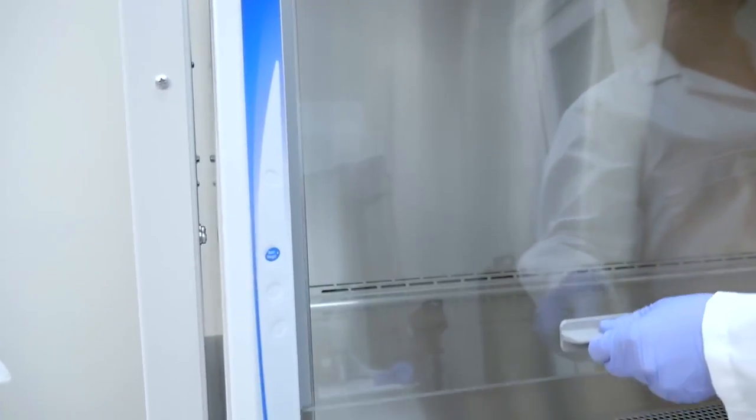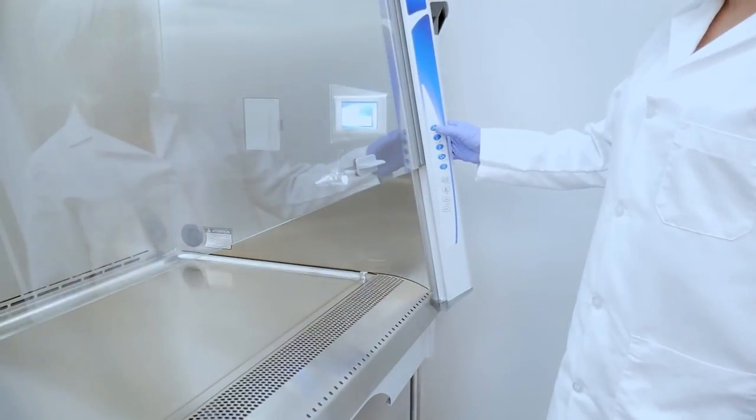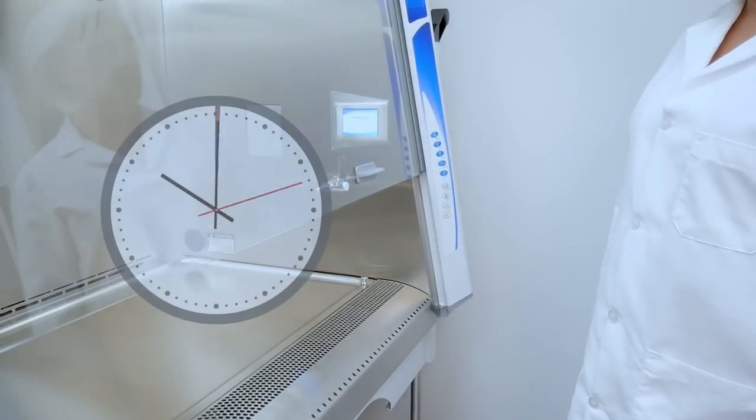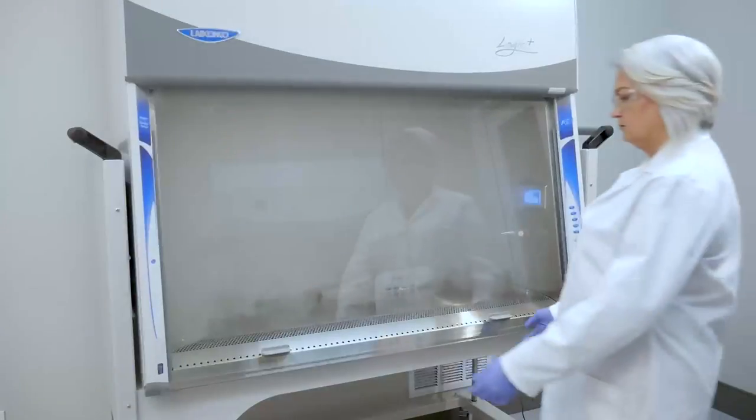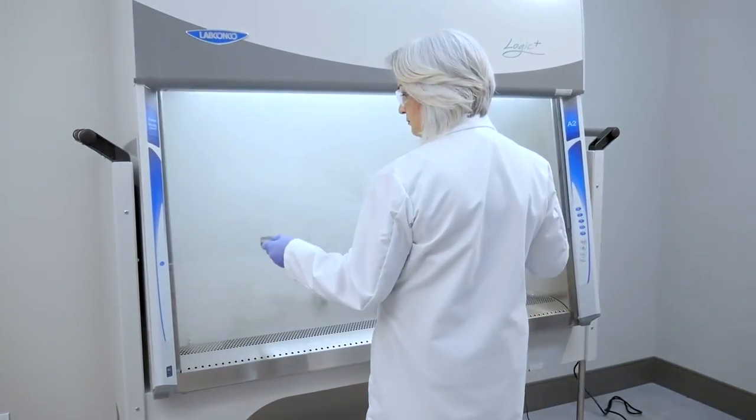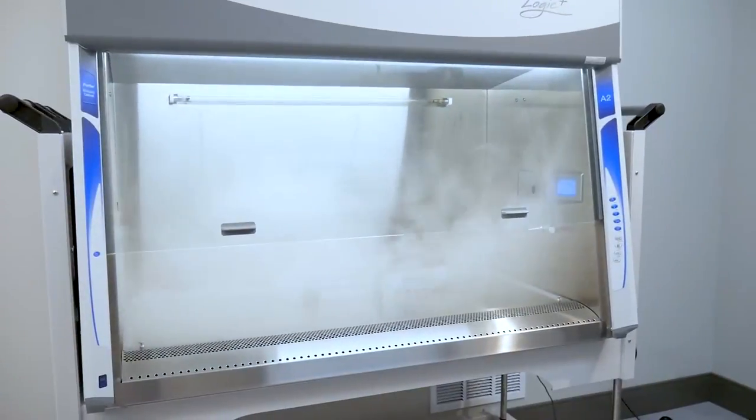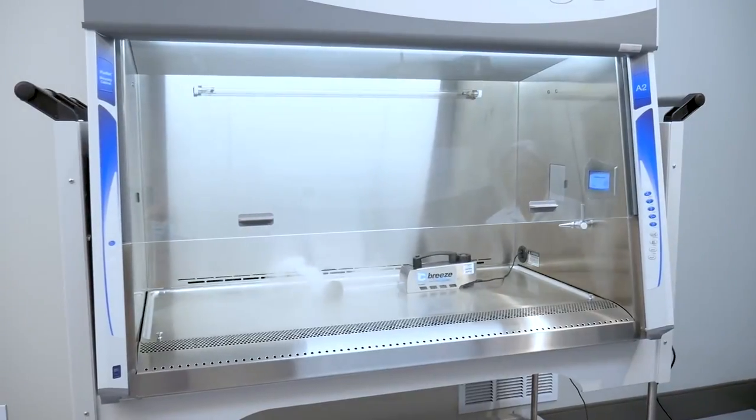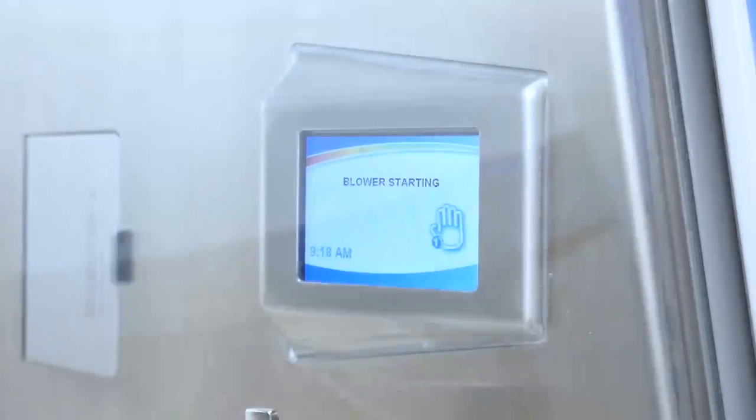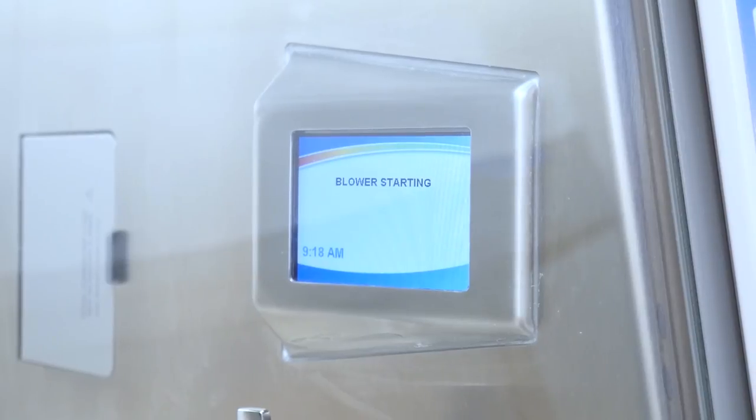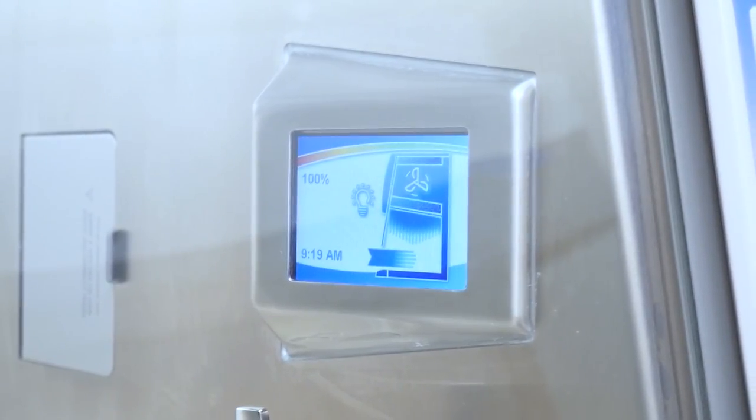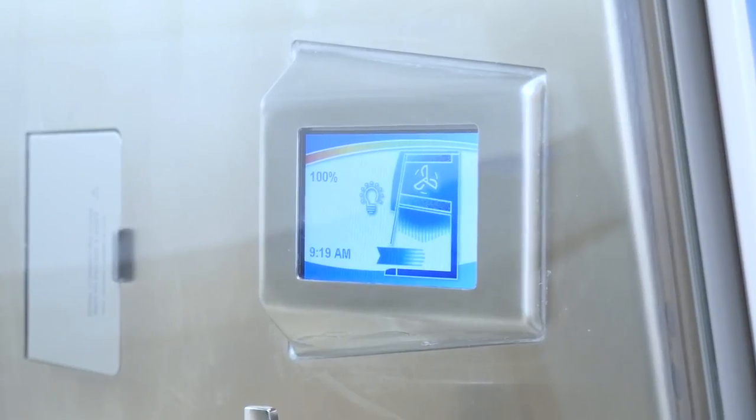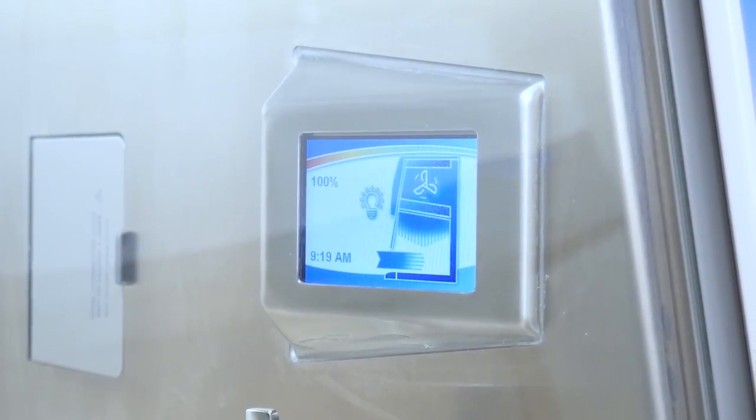Next, raise the sash to the proper working height, then turn on the cabinet's light and internal blower and allow the system to equilibrate and purge out any contaminants for a minimum of five minutes. If the cabinet's smart start feature is enabled, the cabinet blower and light will automatically turn on. As the BSC starts up, a please wait screen will be displayed while the blower is equilibrating. Once this period completes, check that the cabinet's HEPA filter life is sufficient and that no other alarms are present.